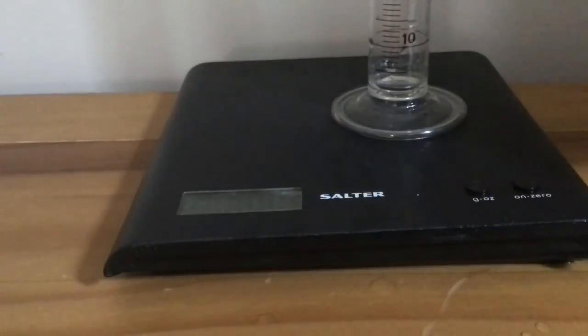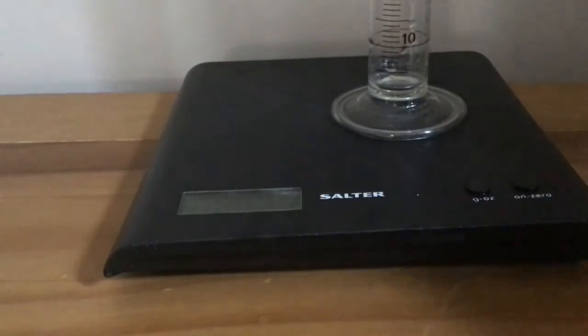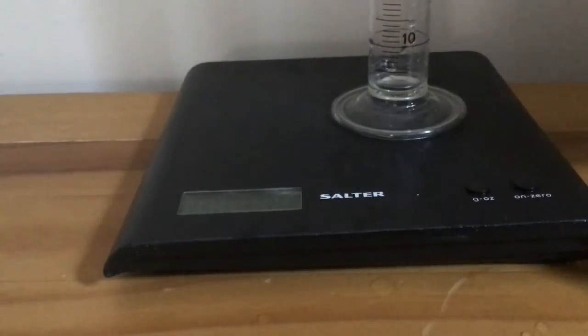So now it's reading zero and we pour in exactly 50 centimeters cubed of water. So it's only measuring the mass of the water.